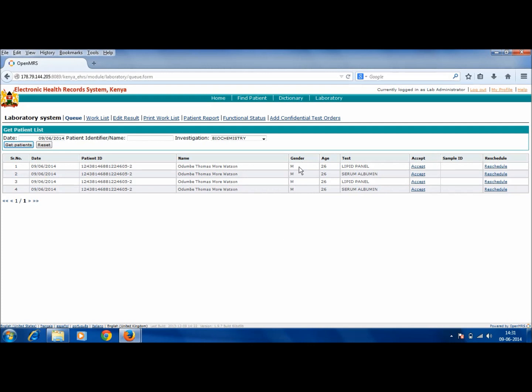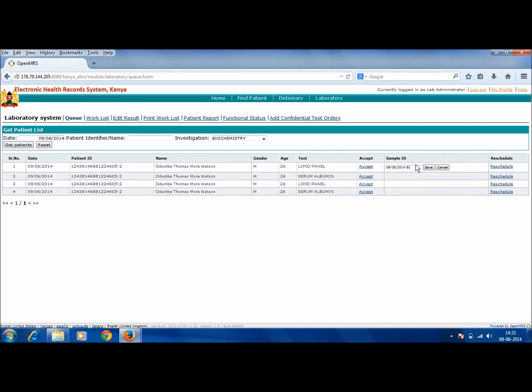The lab administrator must accept these tests once the sample has been physically collected from the patient. To do so, click on Accept. A sample ID generated by the system appears here. To save the sample ID, click on Save.